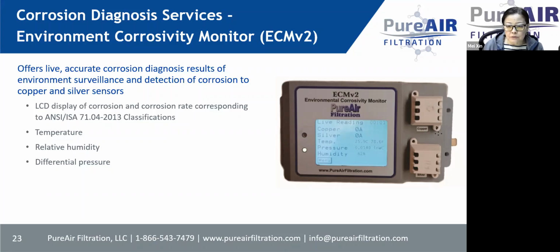I think the whole unit measures based on mass gain. When corrosion happens to the copper and silver, the mass will gain because metal salts build up, and the sensor can read the film thickness. Then you use a chart from the ISA 7104 chart to convert to G1, G2, G3, G4. If your film is below 300 angstroms, you're going to have a G1, and if your film is over 2000, you're going to have a GX level. So that's how it works.